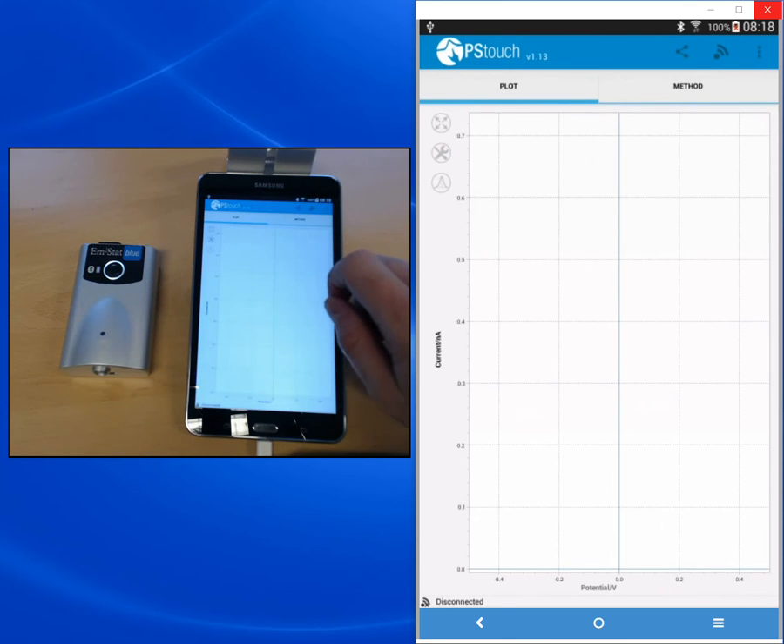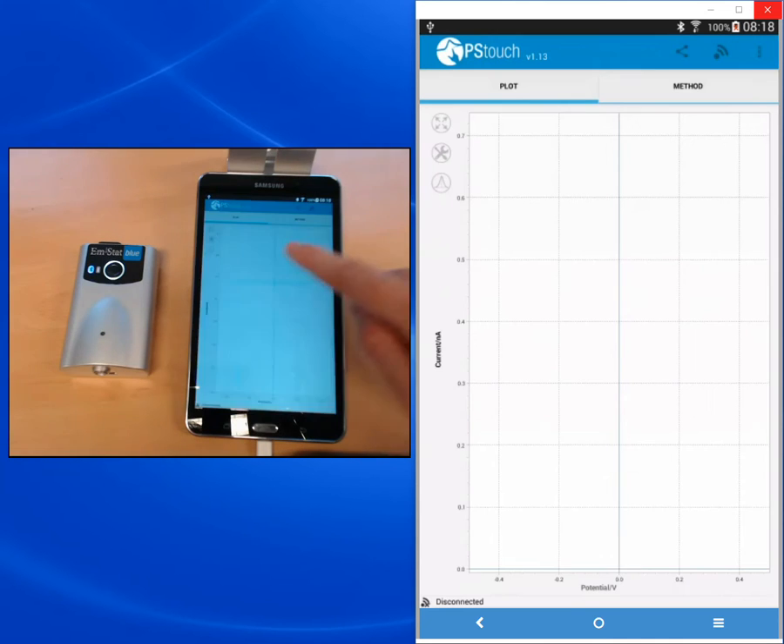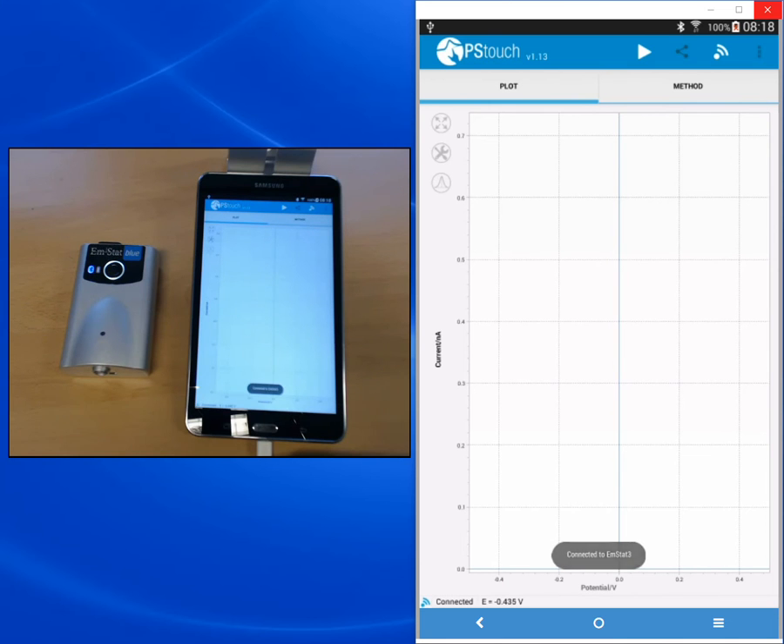Once you tap that button, a list of the paired devices will appear. If your device wasn't paired yet, you can scan for Bluetooth devices, select the correct device from the list, and pair it by using the code 1234. Here the EmStat Blue is already paired with the Galaxy Tab, so I'm just choosing it from the list and the app starts connecting. We are now connected, indicated by the connect button turning white and the connected icon on the bottom left.